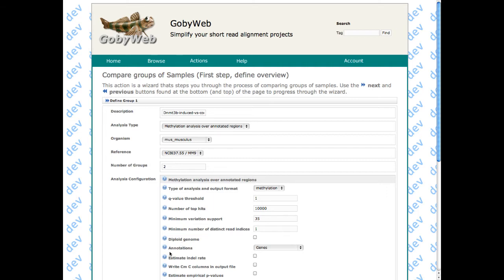And most importantly in this analysis, annotations. We have a predefined set of annotations to estimate methylation over. Here we're demonstrating over CpG islands, but you can select genomic tiles, UTR regions, promoter regions, intronic regions. You can also alternatively combine all those regions and output one table.